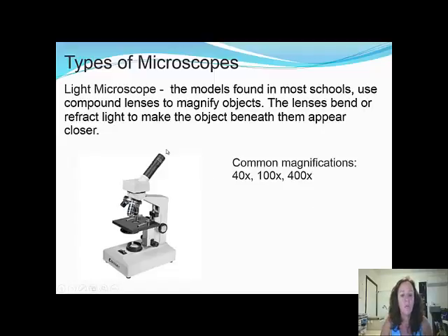We will be using a light microscope. The model found in my school has what's called compound lenses, because there's a lens in the eyepiece and there's a lens here as well — that's why it's called compound — and it's used to magnify objects. The lenses bend or refract the light to make the object beneath them appear closer. Common magnification levels are times 40, times 100, or times 400.